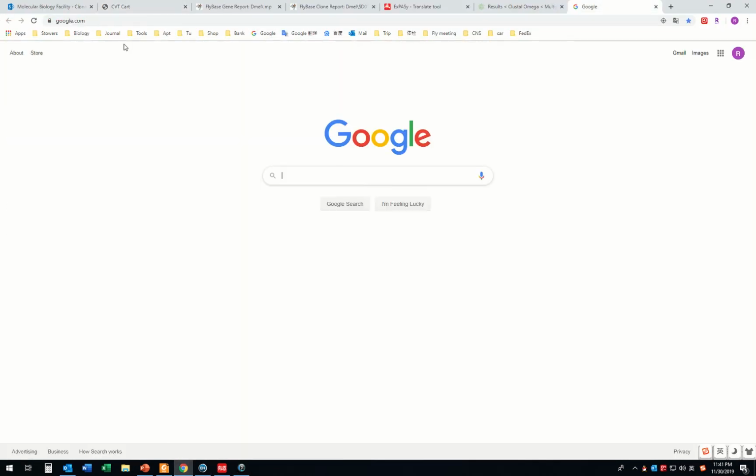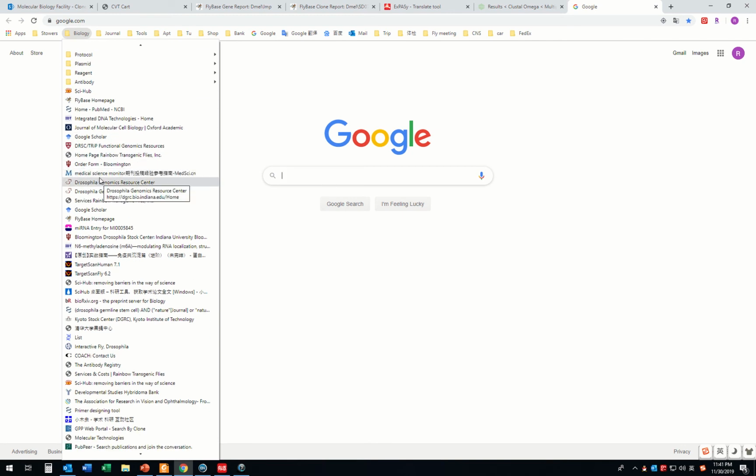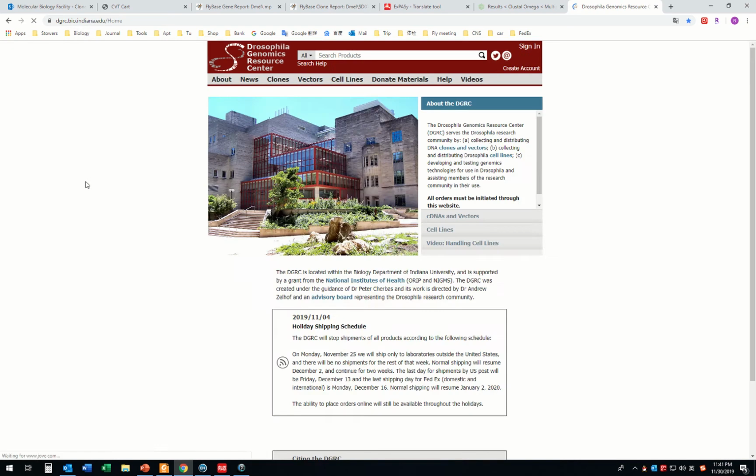So we can go to another site, the Drosophila Genomics Resource Center, the Drosophila reagent page.